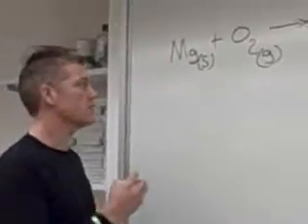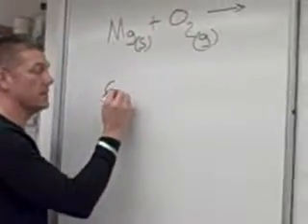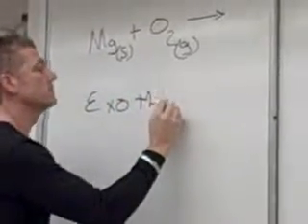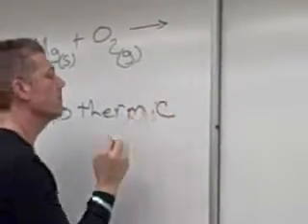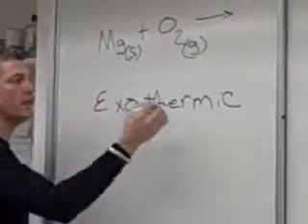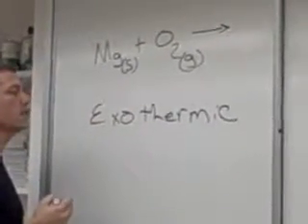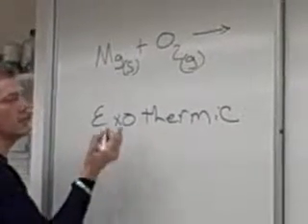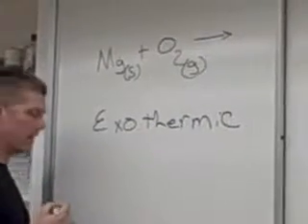For example, is the reaction exothermic? Meaning, is there energy or heat coming off the reaction based on your observation? Or is it requiring energy?